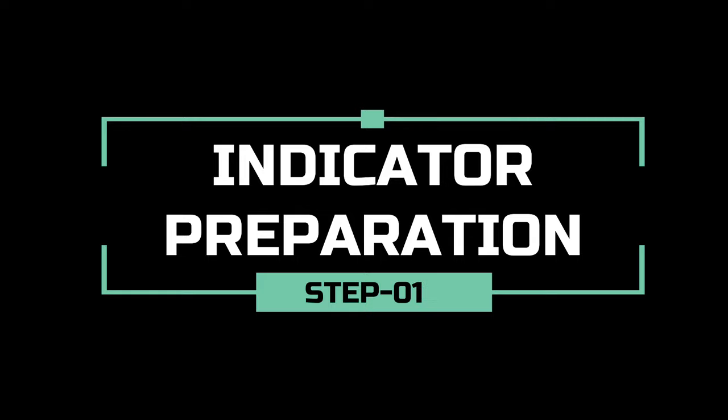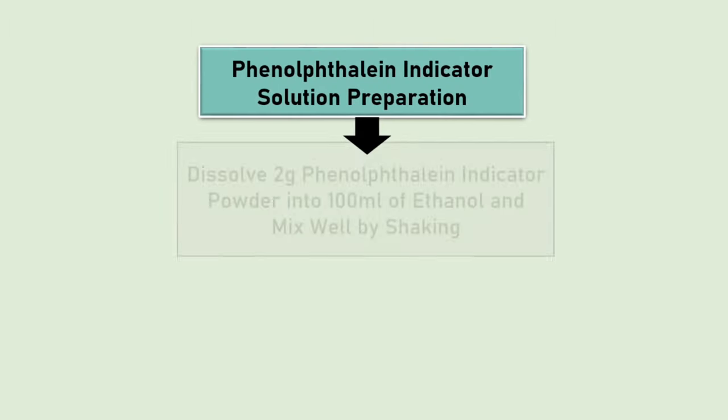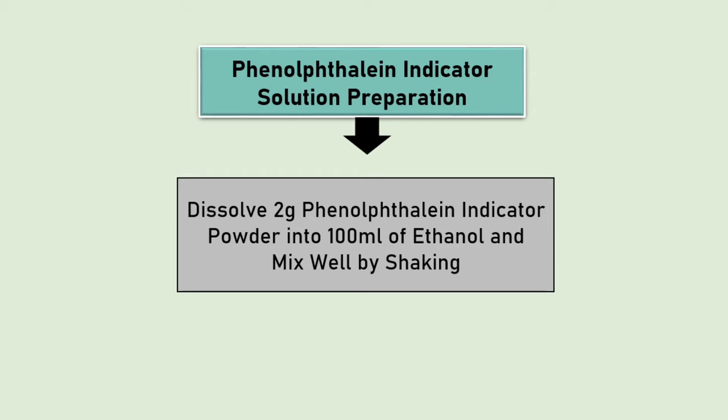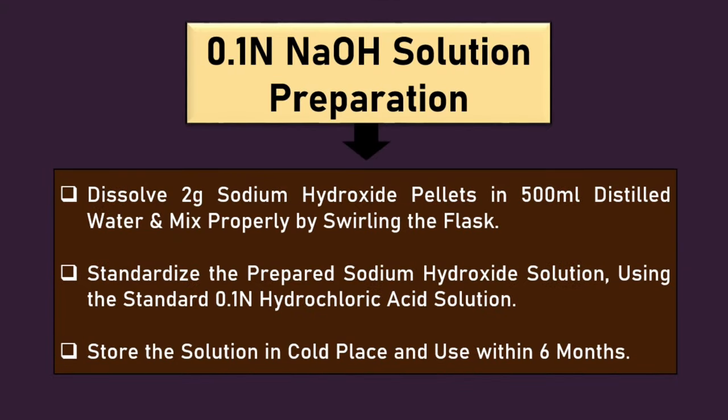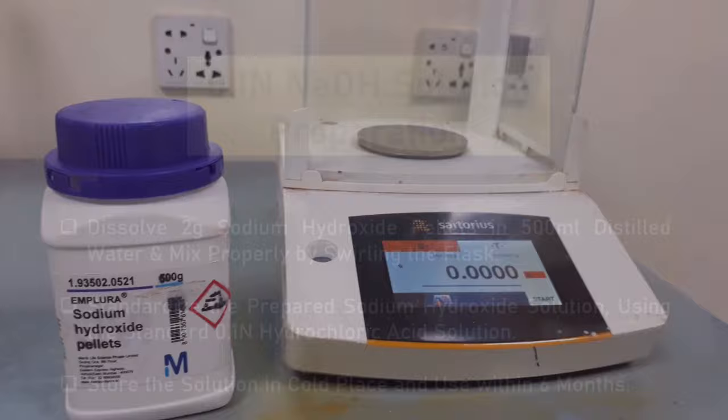For the preparation of phenolphthalein indicator solution, dissolve 2 grams phenolphthalein powder into 100 ml ethanol and mix to dissolve. First, we will prepare the expected 0.1 normal sodium hydroxide solution by dissolving 2 grams of sodium hydroxide pellets into 500 ml distilled water.